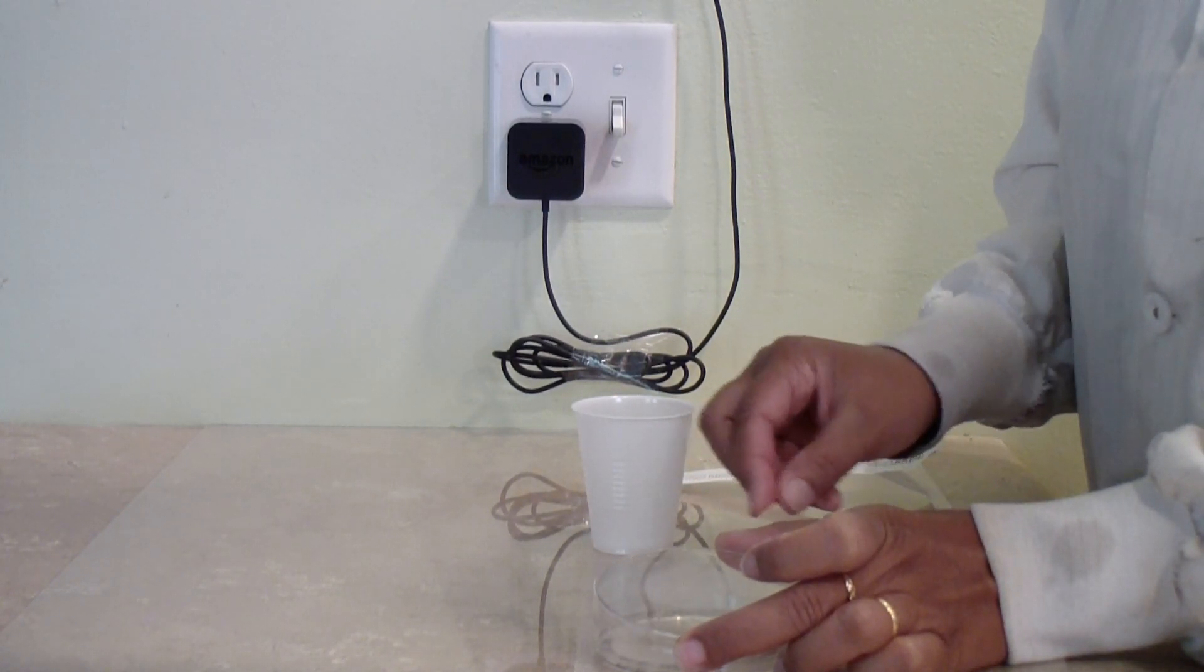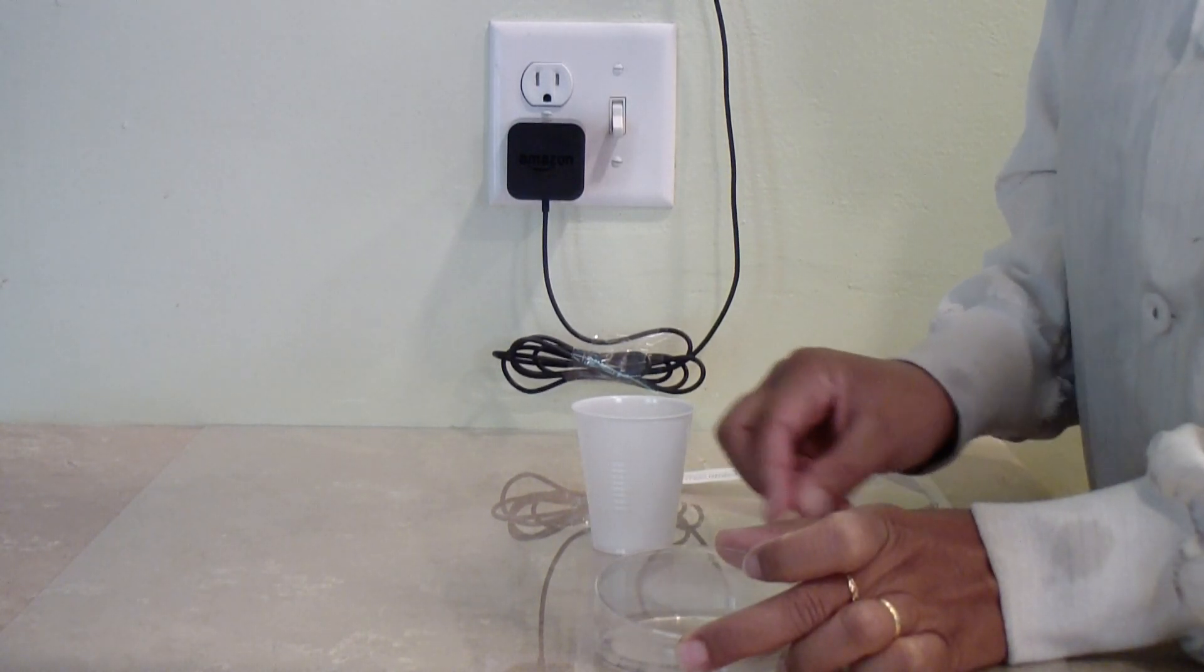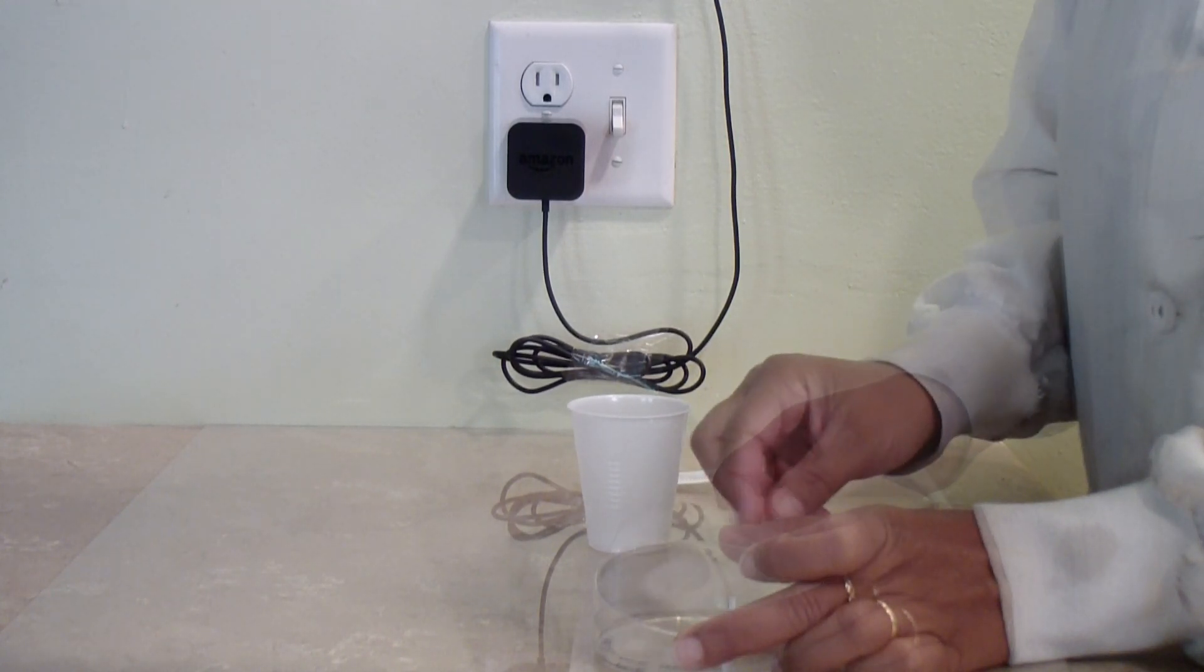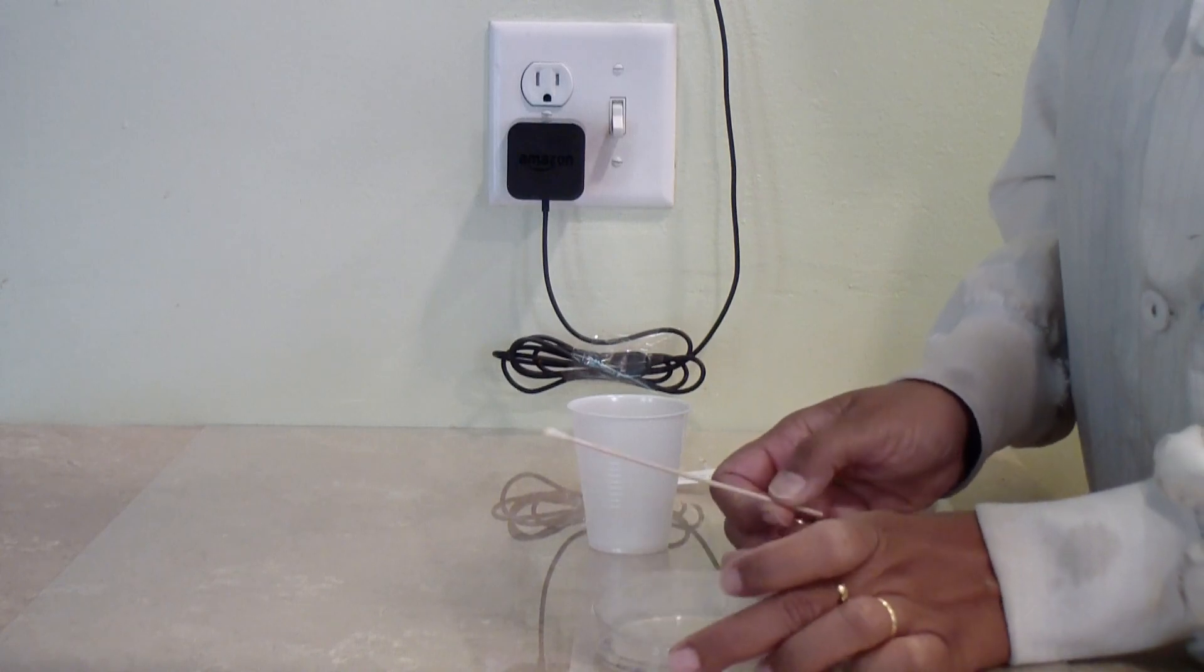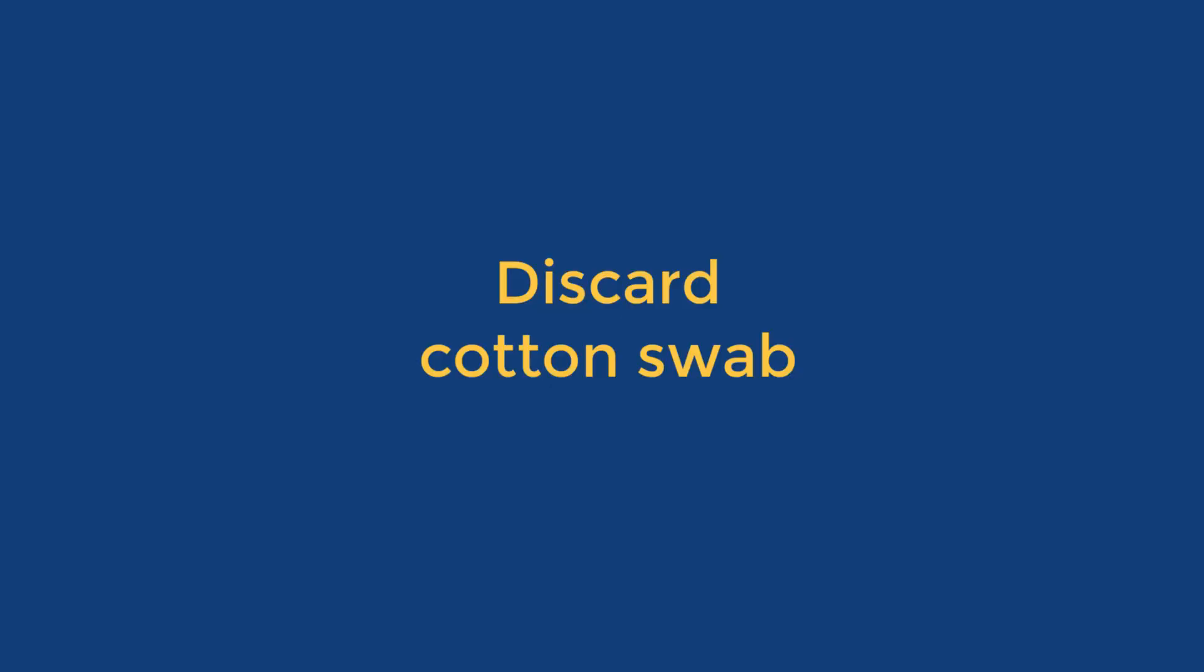Spread some yeast mixture gently over the surface of the plate. Because you only open the plate a little bit, you will not be able to reach all areas of the plate. Turn the plate around so you can spread from a different angle. You may discard the cotton swab with your regular household waste.